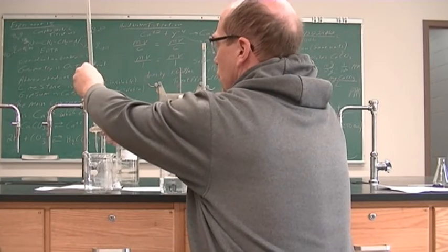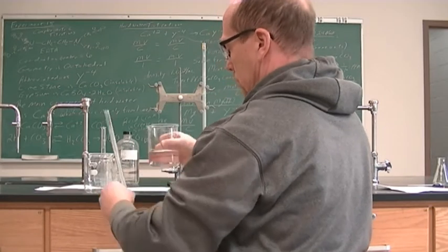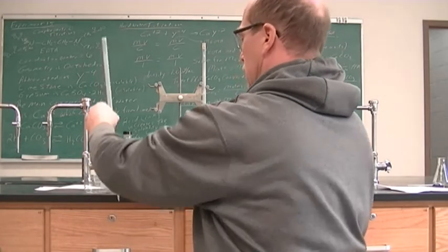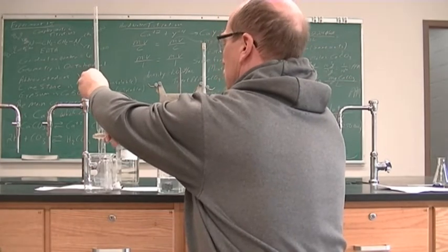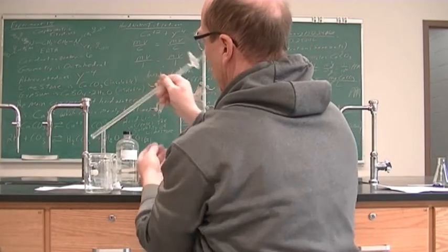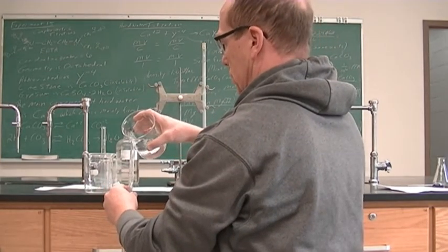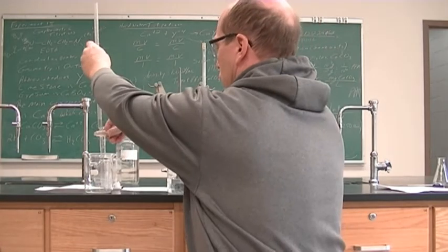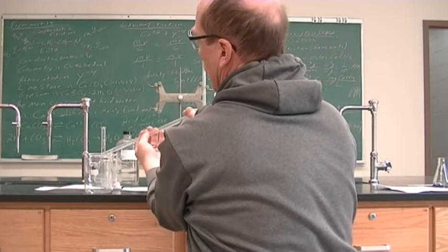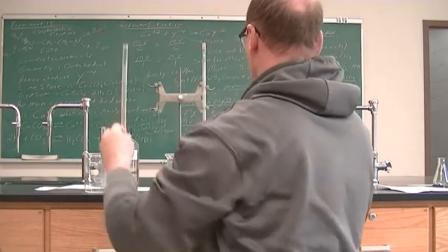All right, so I rinse it once. Rinse it twice. All right, so now this is all wet with tap water. And so now we're ready to fill this up.